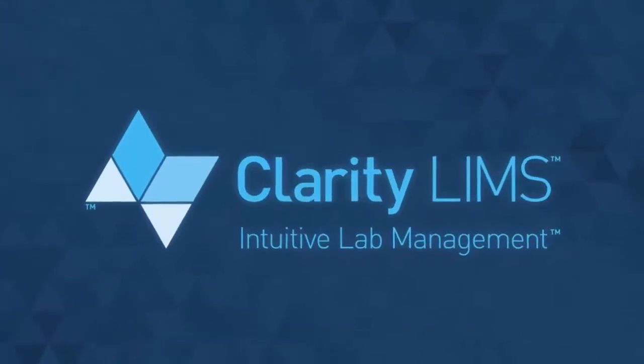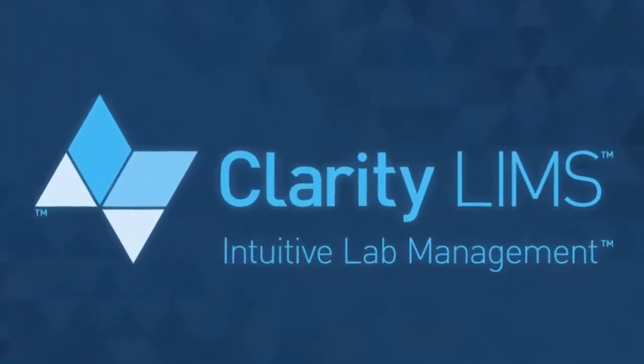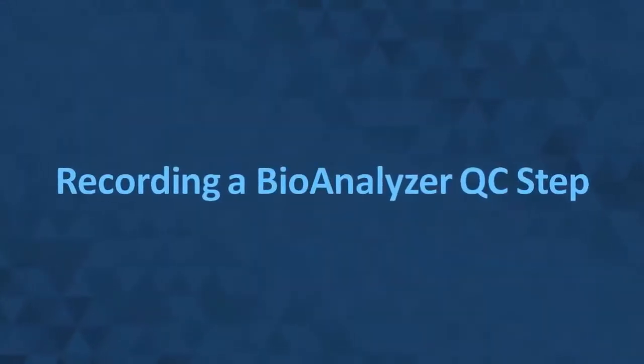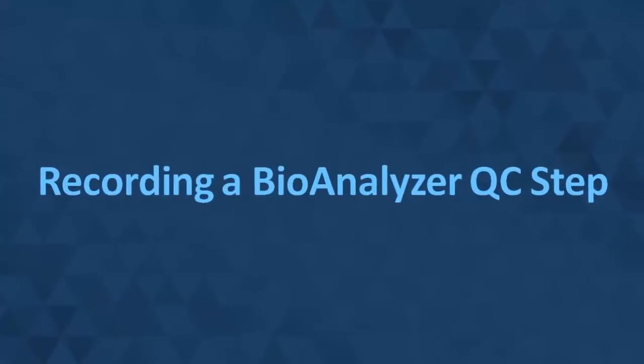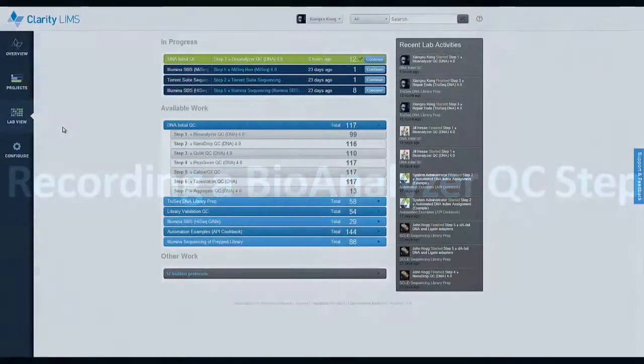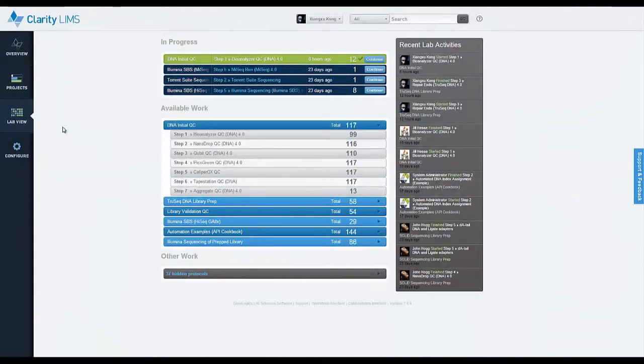Hello. In this video, we will look at how to use Clarity LIMS to record a BioAnalyzer QC step, and how to use the out-of-the-box features of Clarity LIMS to generate a sample list for BioAnalyzer QC, as well as parse in the result file.